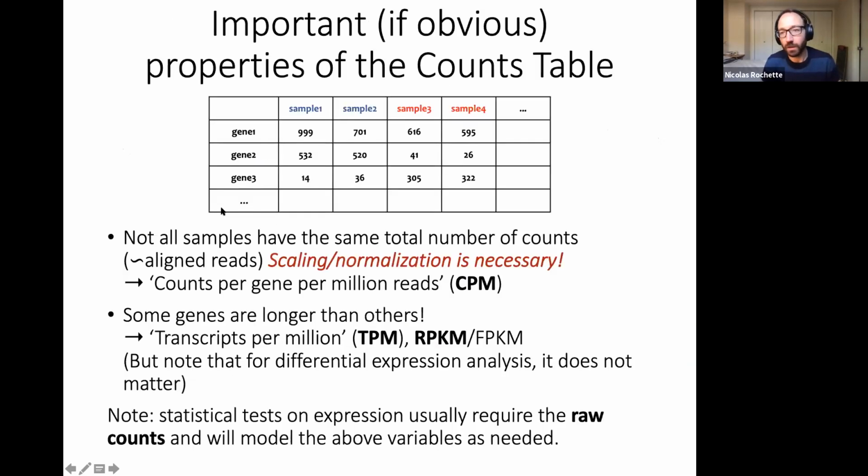And so that's going to give us this table of counts, and this is really where the bioinformatic analysis of RNA-seq ends in the most common, the most standard case. Then that's where the statistical treatment begins, which is what we're going to talk about in next week's workshop.